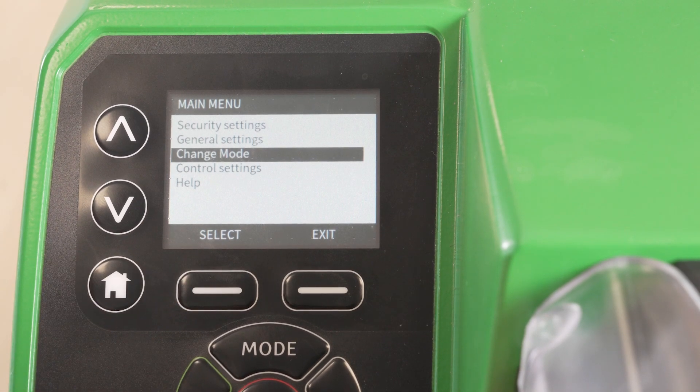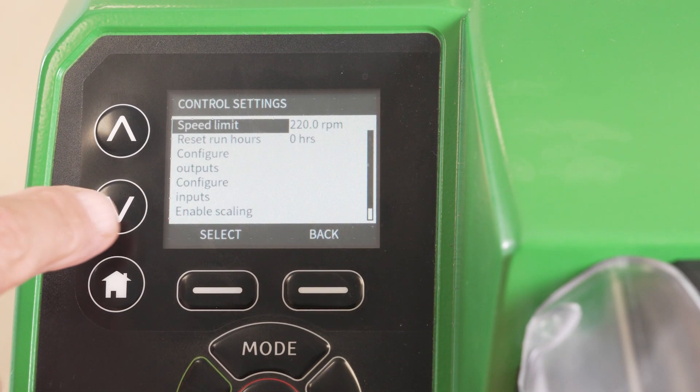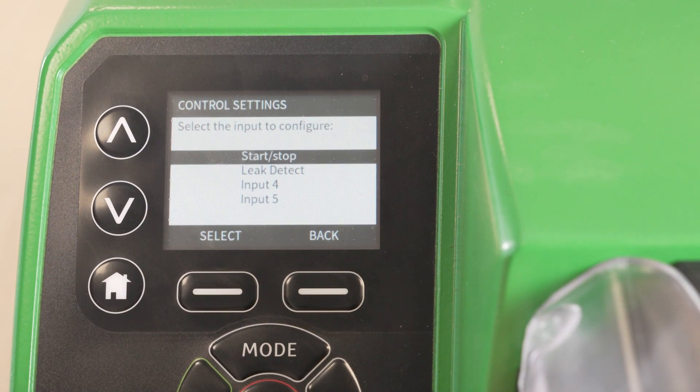Select menu. Select control settings. Navigate to configure inputs and select. Here we can see the list of digital input options. In this video we'll be demonstrating configuration of the start/stop input.